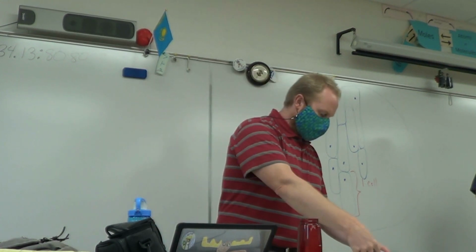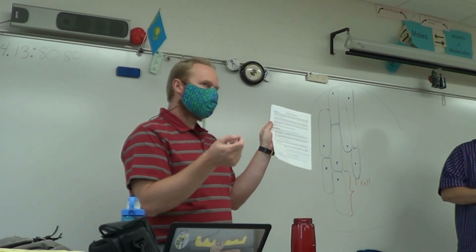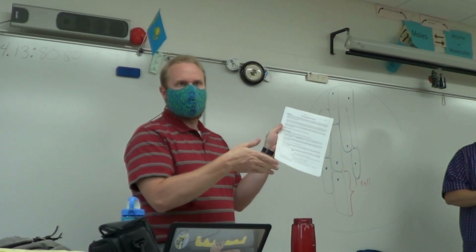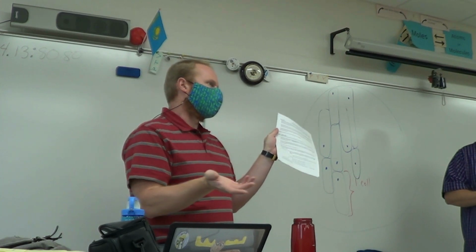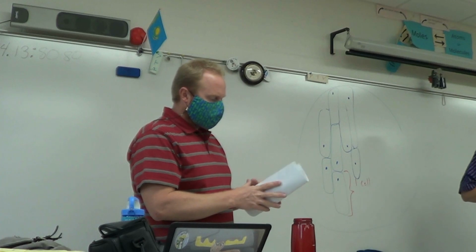The difference is on the onion cell, instead of using water for our wet mount, the onion skin is really translucent. So we're going to stain it, and we're going to stain it with iodine, and that's going to be our liquid for our wet mount, because it will help stain. Be careful, it's stained. You don't want it on clothes. It'll stain. It's iodine that we're using today for onion. But that's what you're going to use for your wet mount.